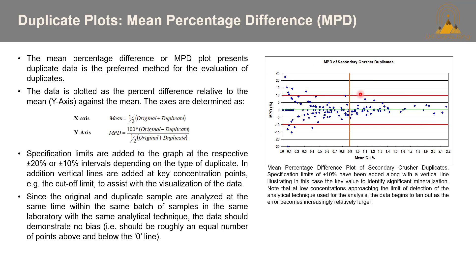Since the original and duplicate samples are analyzed at the same time, within the same batch, in the same laboratory with the same analytical technique, the data should demonstrate no bias — meaning a roughly equal number of points above and below the zero line, shown here in green. Should any bias be evident, it's a cause for concern and requires follow-up. You can see here there is a lot of movement from this line, which is definitely a cause for some concern.